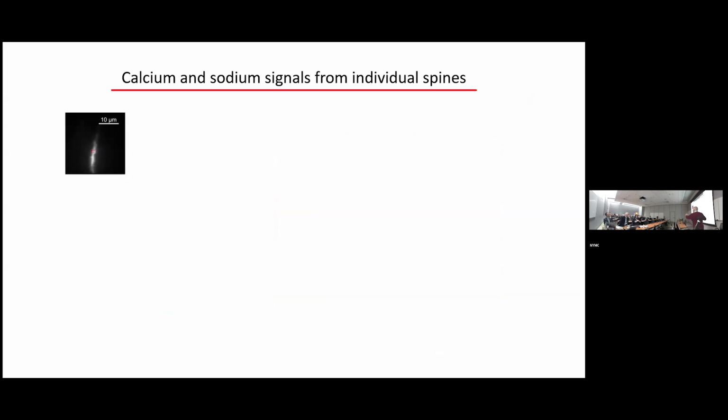Okay, this picture looks a little funny because I'm going to fill up the screen with other things. But here's a piece of a dendrite, and we're going to stimulate it. The way we stimulate it is the electrode in the soma is used to stimulate this back propagating action potential, and it not only can stimulate it, but it records it. This is a recording in the cell body. And then the stimulating electrode can stimulate a synaptic response, and then a second synaptic response, which is super threshold for generating an action potential.